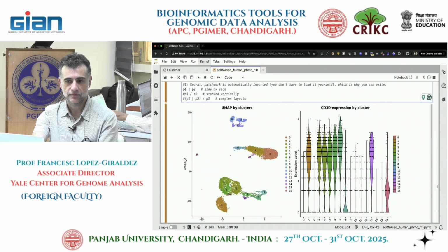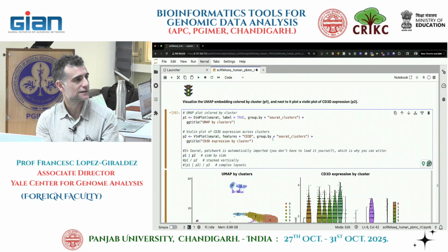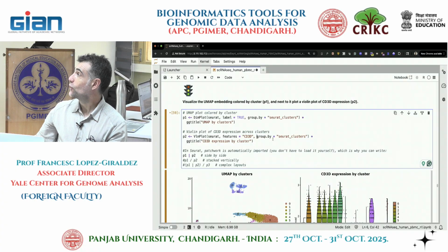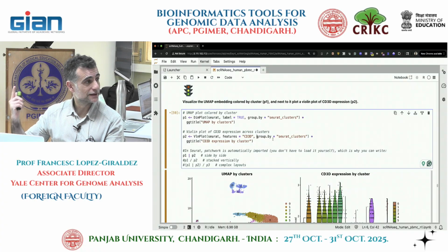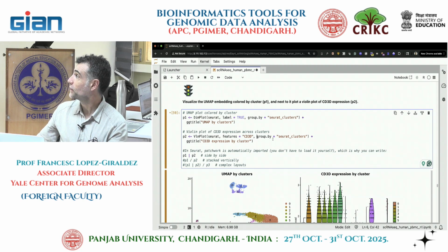Group by leads into name. You don't need the group by probably in the violin plot because it takes the active identity. All this code is somewhere up in the notebook. I didn't create anything especially new, except the only thing I asked to change was the feature. Oh wait, hold on. Oh yes, the dim plot without this is the feature one. That's the only thing that's different from the rest.